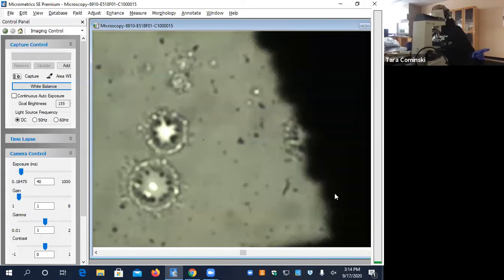Well, the term total magnification encompasses both the ocular lens magnification and the objective you're using. So right now we're using 40x here, but how much are the ocular lenses worth? It actually says it on the side of yours, I think. 10. 10, right? So the total magnification is the ocular 10 times whatever objective you're using. So what is it? 400. Yep, 10 times 40, 400. Good.